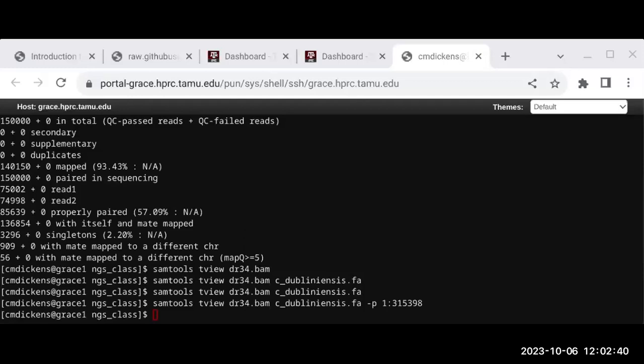This is a different track showing you the VCF file. The VCF file will show you where in JBrowse will highlight this SNP. It will show you what the variant is, from T to a G. And if you look here, it's only going to show you what's different from the reference. So this is a heterozygous SNP.